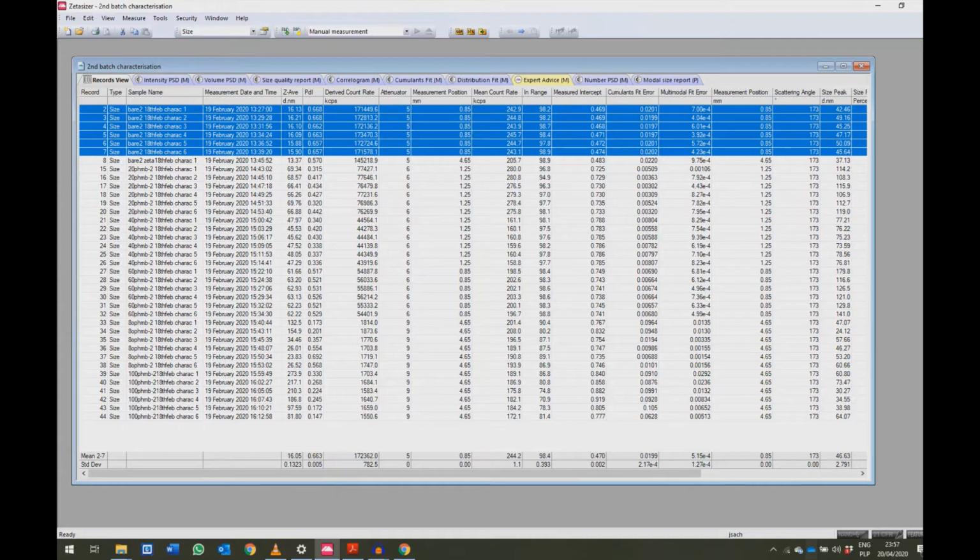Okay, and so the first thing you're looking at is, if you select your samples, you'll have your mean and a standard deviation at the bottom. So I'm looking at all those parameters across, and I'm looking at what the standard deviation is on those parameters. If there's too much standard deviation, it might mean that the data isn't reliable. And in my experience, the more PHMB there is, the trickier it gets.